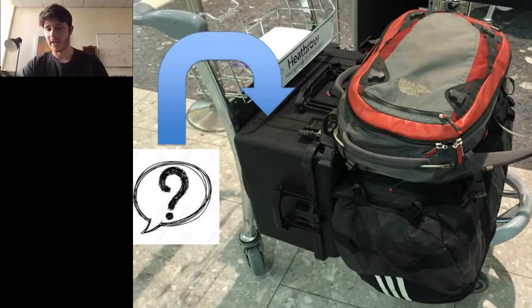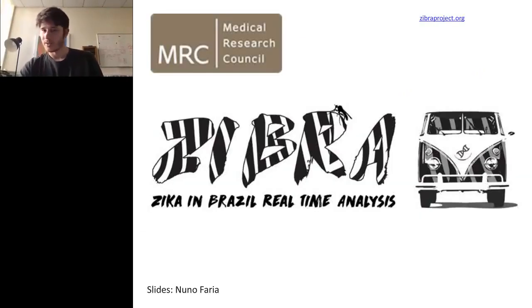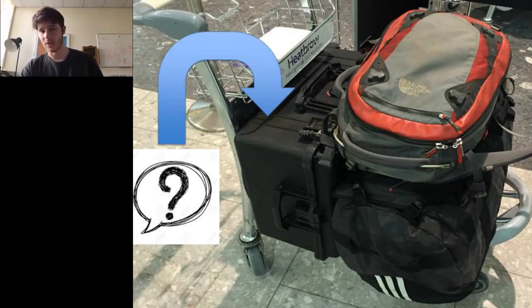It's not exactly the same application, but nevertheless, genome sequencing can still be used to understand the structure of the population of viruses that are circulating, and that can tell you quite a lot, as I'll come on to in a minute.